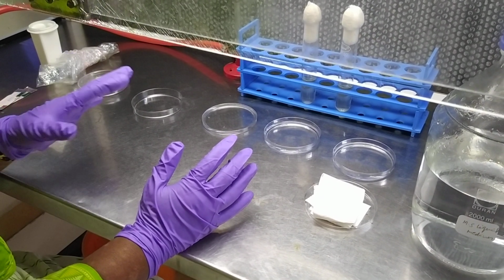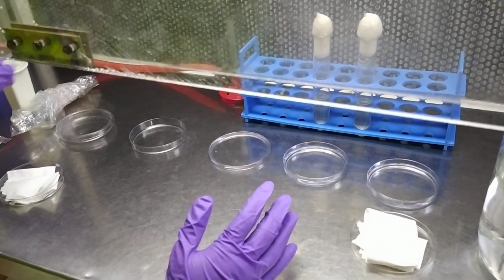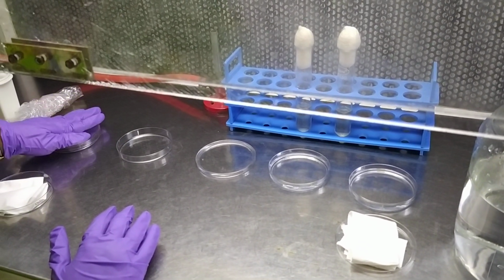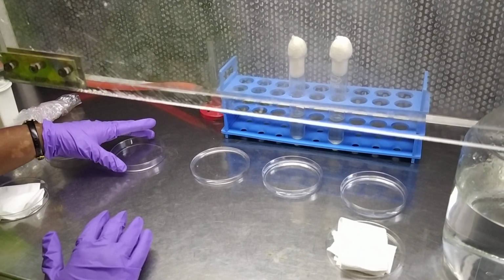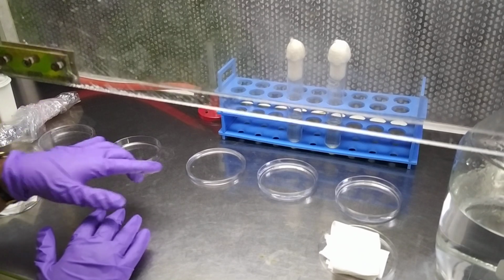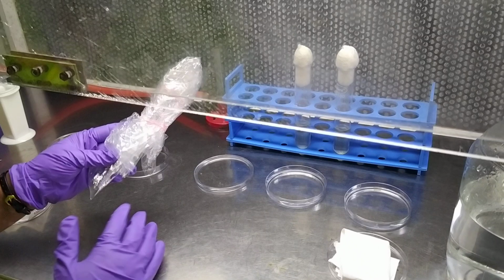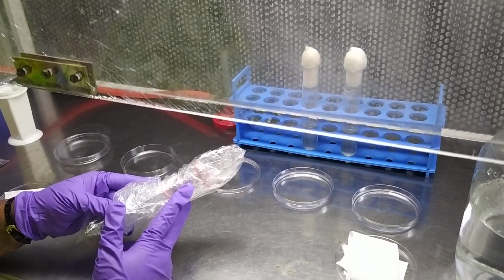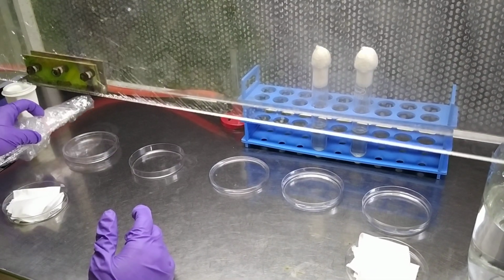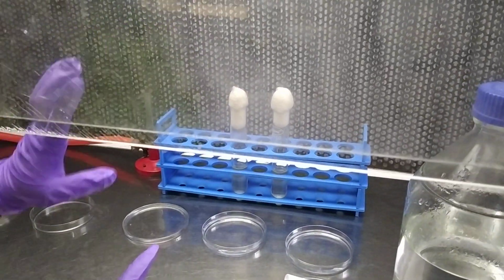So for the requirements, the setup comes like this. We'll be arranging the petri dishes in a sequence for the surface sterilization. The first plate will have 70% ethanol, the second sodium hypochlorite, and subsequently 3 plates will be filled with water for washing. The scalpels, blades, and scissors we are going to use for cutting the explants and for the inoculations are already sterile, and we place them in the laminar. The sterile autoclaved distilled water is kept, and the media in which we are going to inoculate is kept.